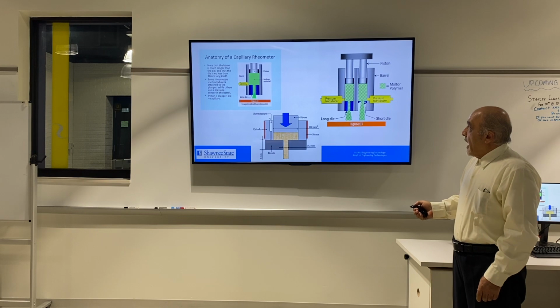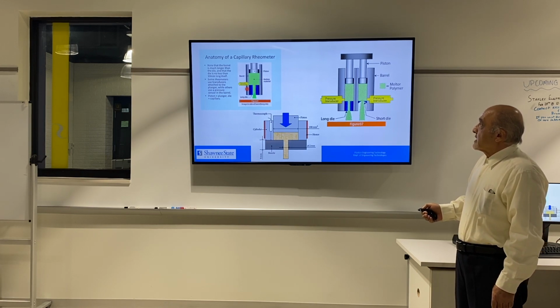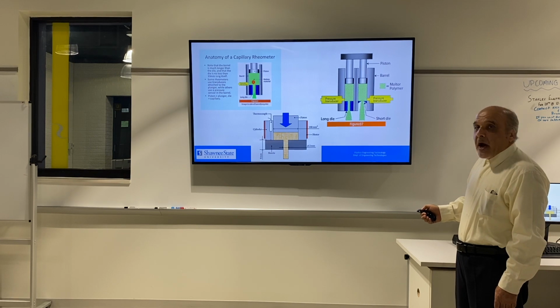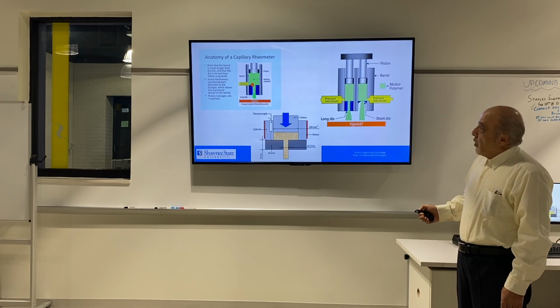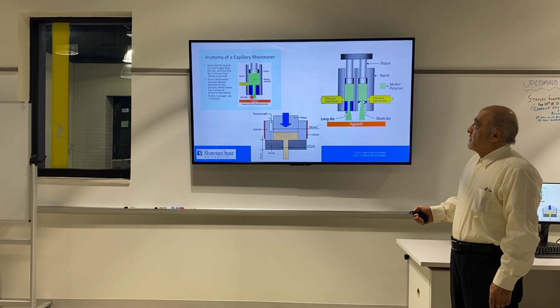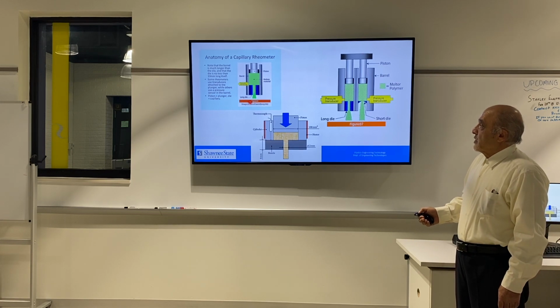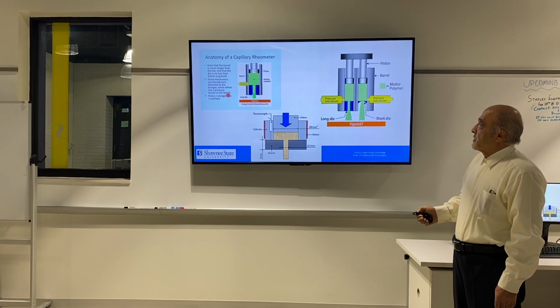So here you have a capillary, and the concept and theory is that we apply load or force to the material, and we measure shear stress versus viscosity, shear rate versus shear stress, and shear rate versus viscosity.